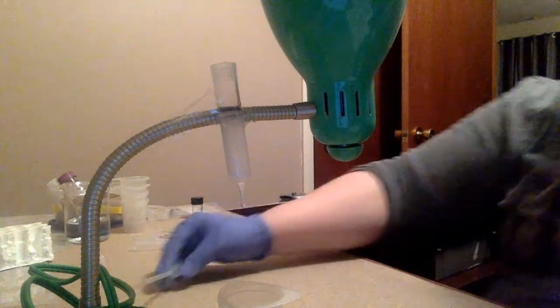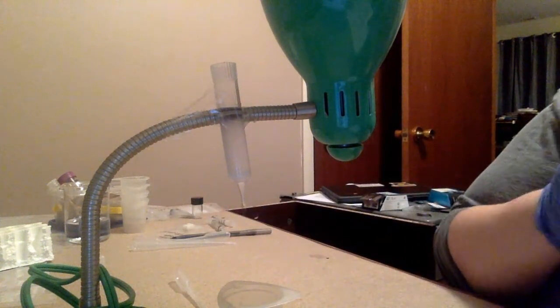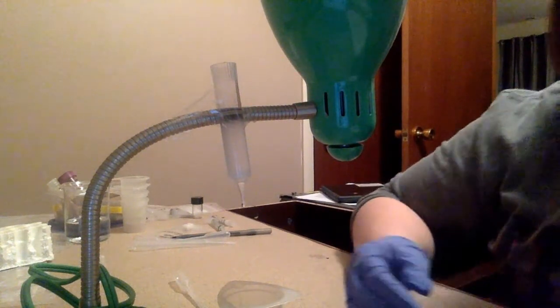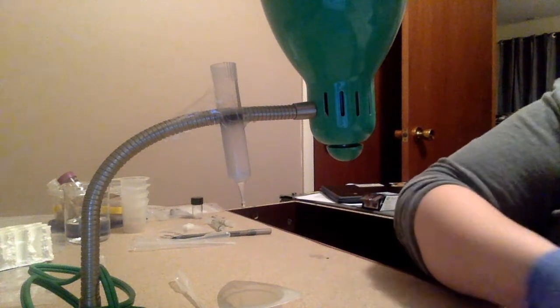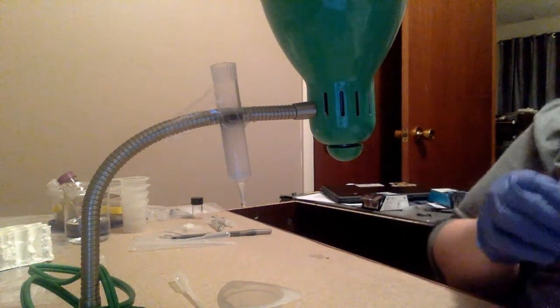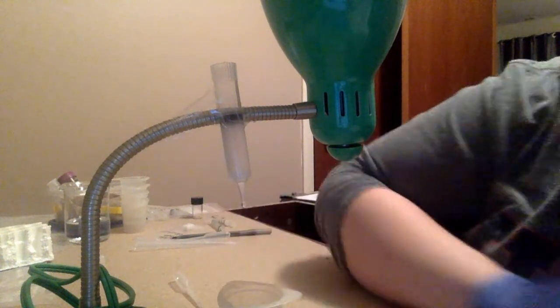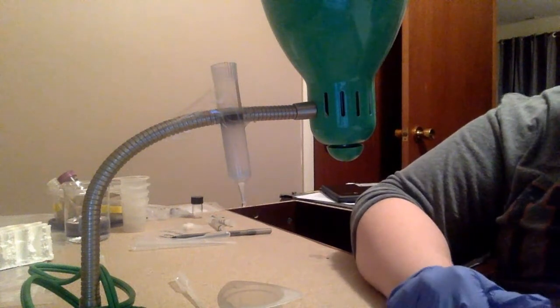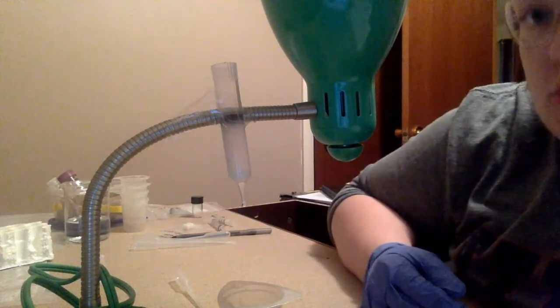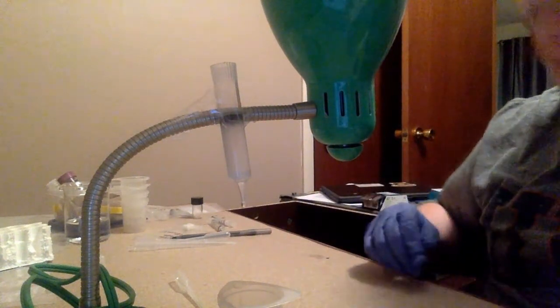And the thing about this is, for this lab, we have to pay really close attention. Because what's going to happen, typical types of chromatography may require further processing of the components as we collect them. The cool thing about gel filtration chromatography is as it separates, they're going to separate by color. So all I have to do is look out for the individual colors and collect them.